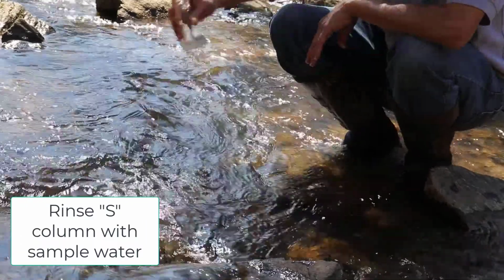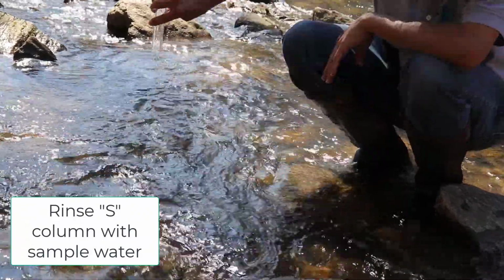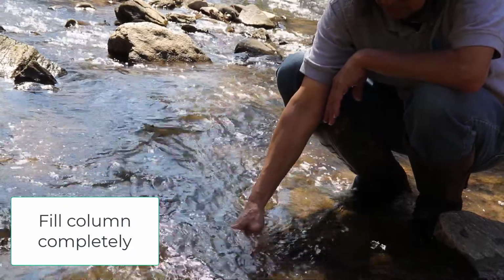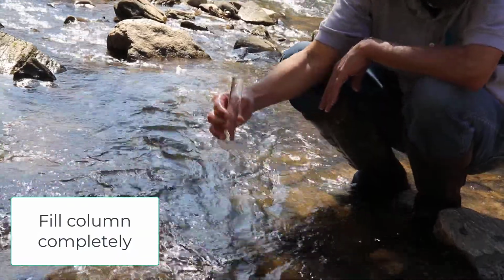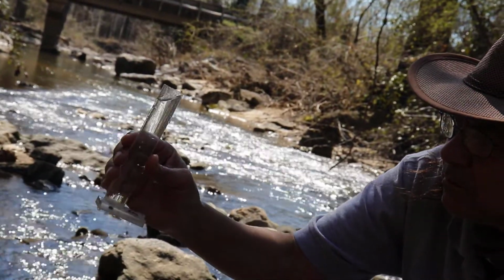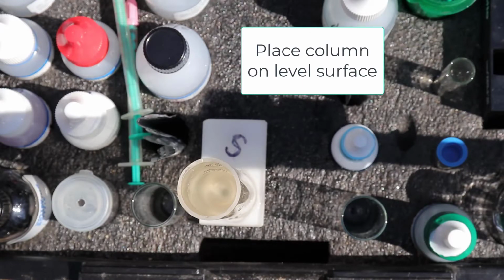Rinse the S column 3 times with sample water from the water body. Then fill the column completely. Flick out excess water until the bottom of the meniscus is at the 50 milliliter line with sample water. Place the S column on a level surface, like in the center of your kit.